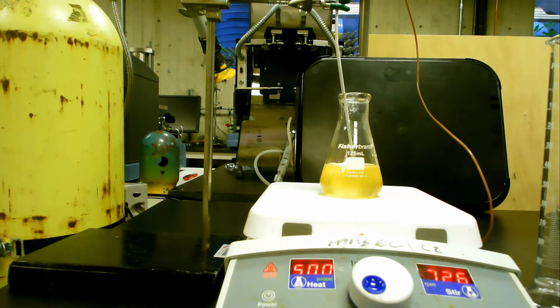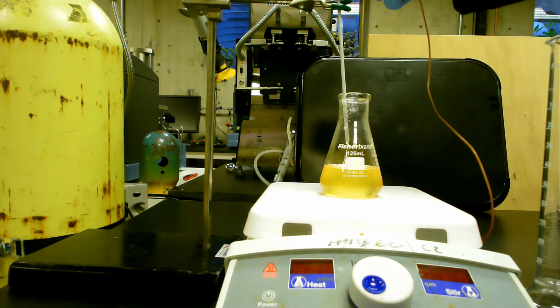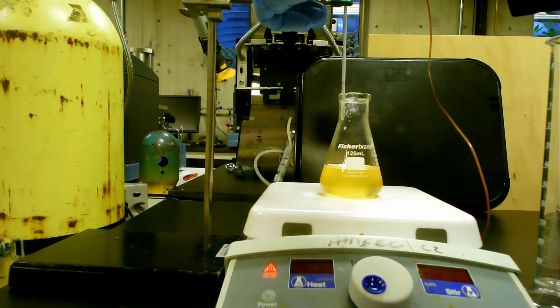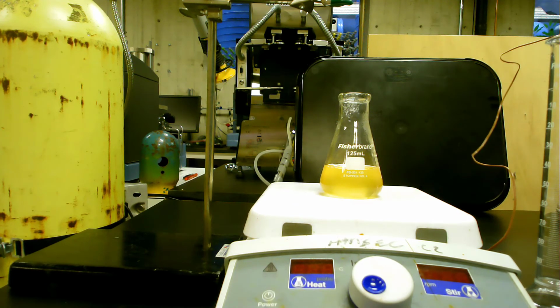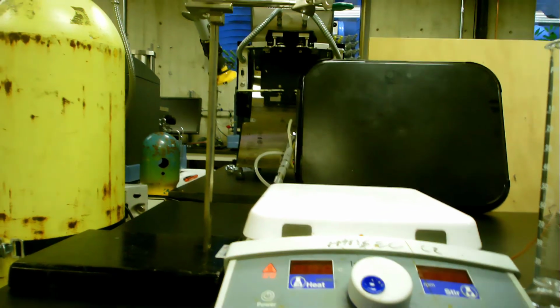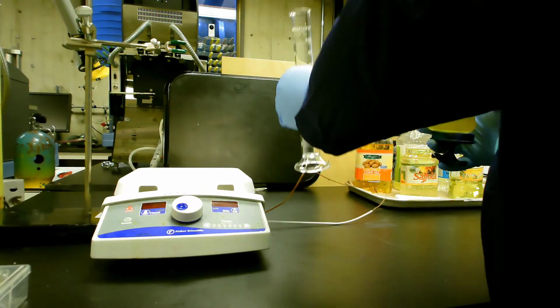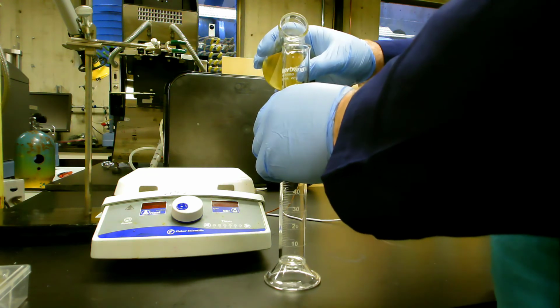Once the reaction has completed, we will just turn off the heating and stirring plate and remove our temperature probe. Now the temperature probe does have the reaction product on it, so we will be sure to clean it appropriately later. And so to prevent the stir bar from ending up in our graduated cylinder that we're going to pour the product into, we're going to use a magnetic stir bar retriever, which is just a larger, strong magnet. And we will hold the stir bar into the Erlenmeyer, and it will stay there as we pour our solution.